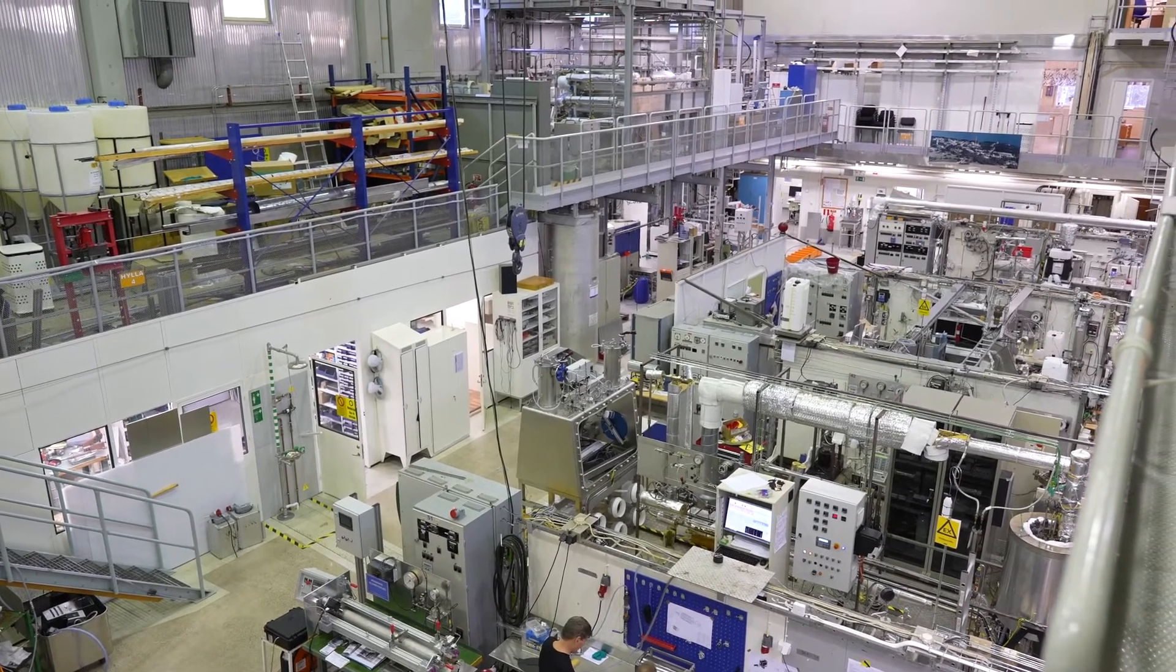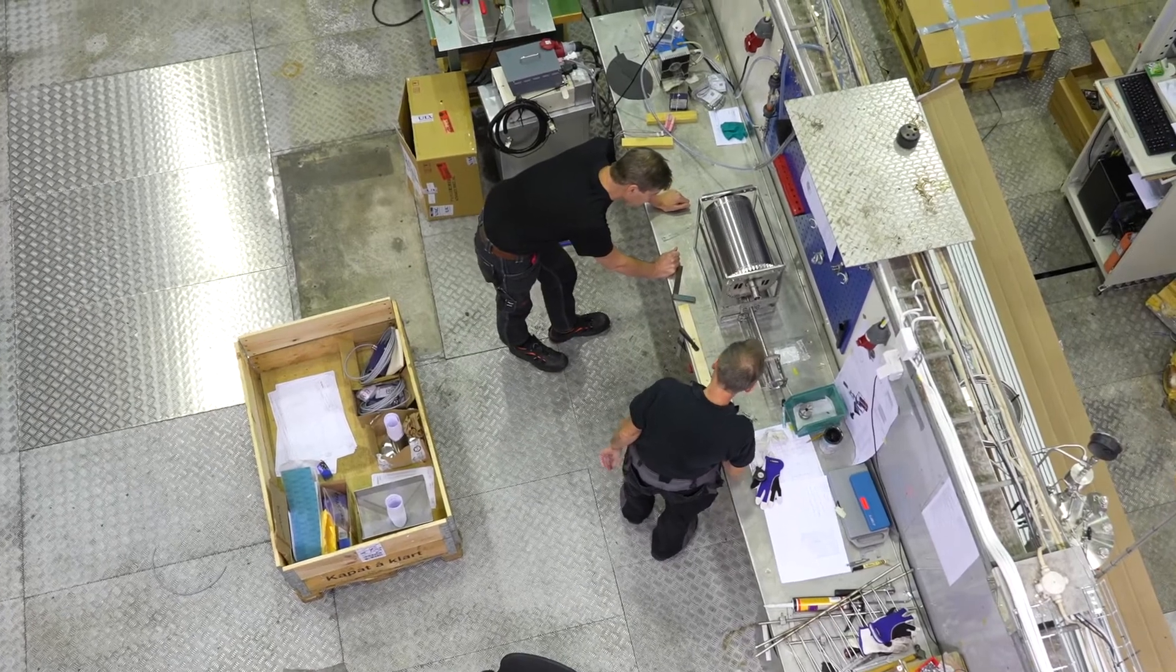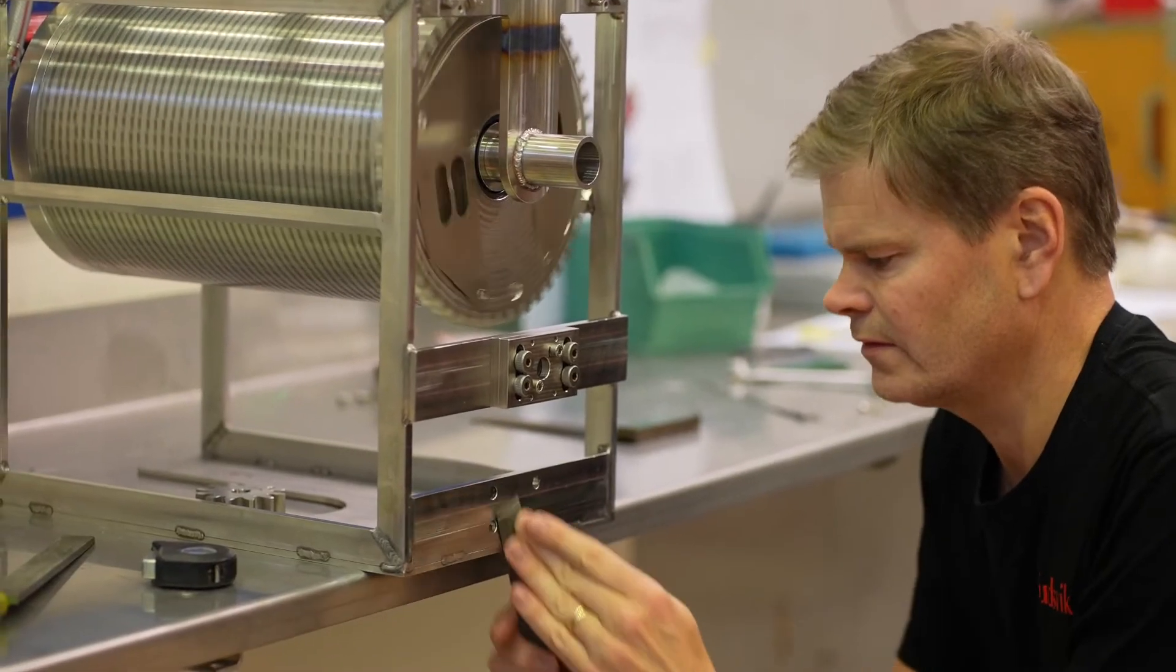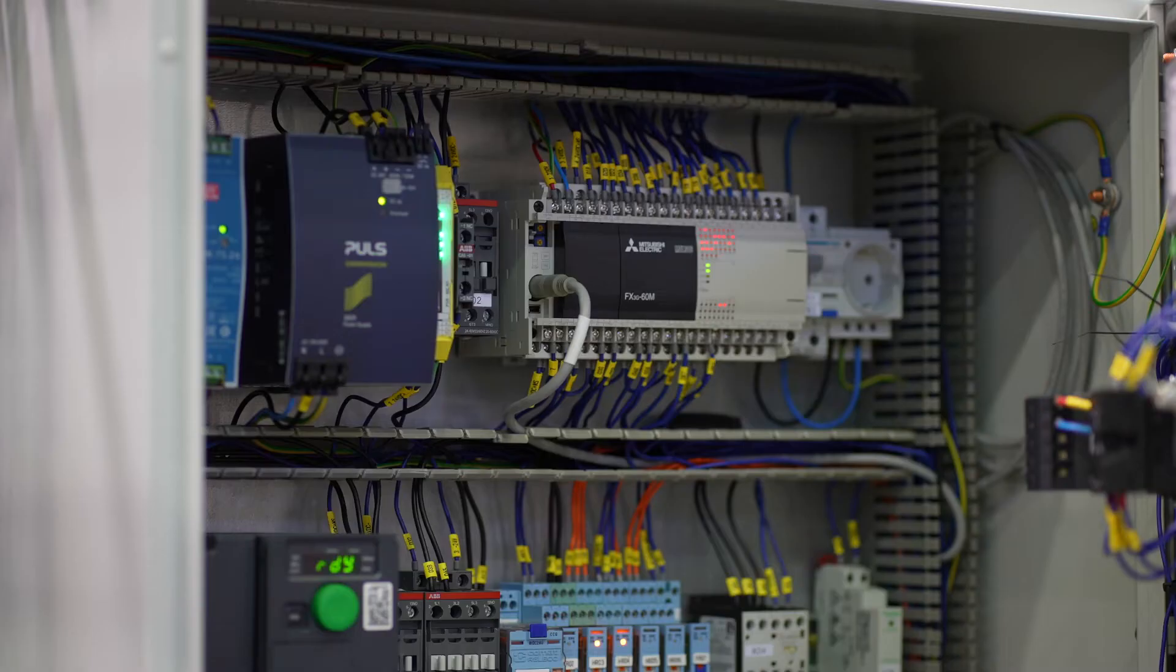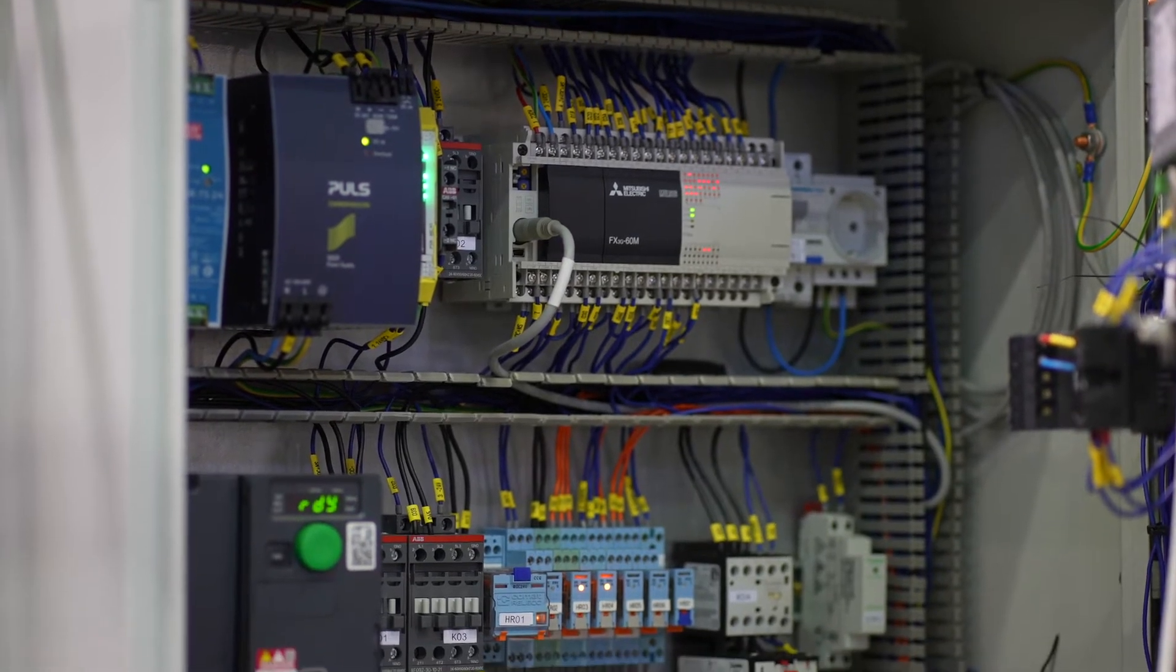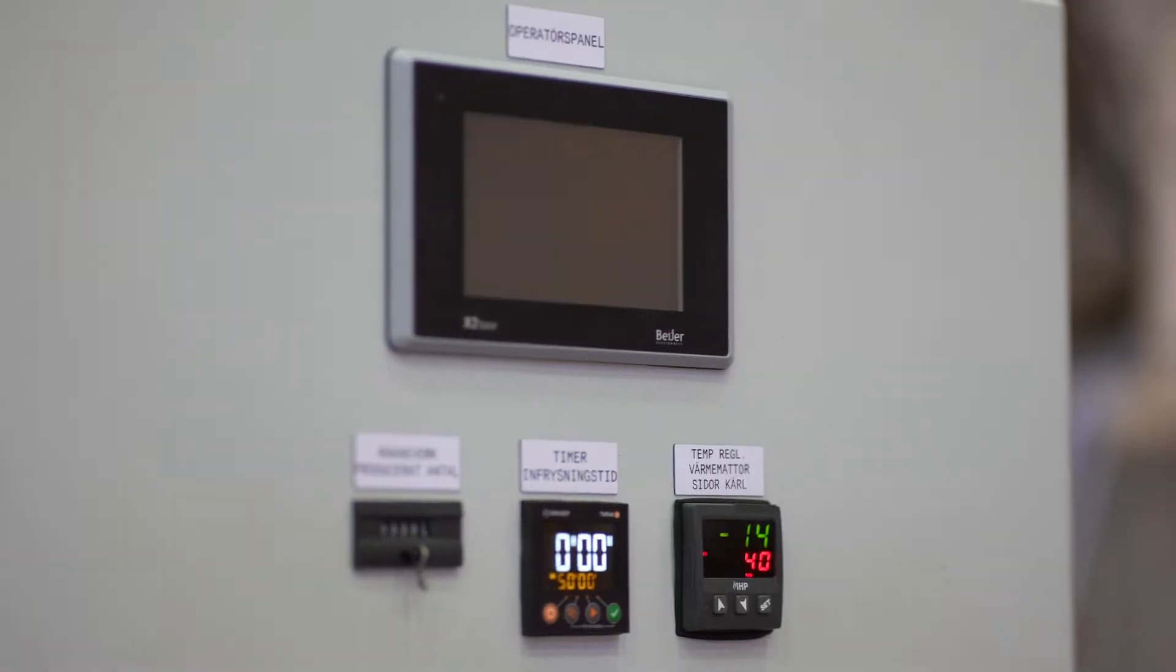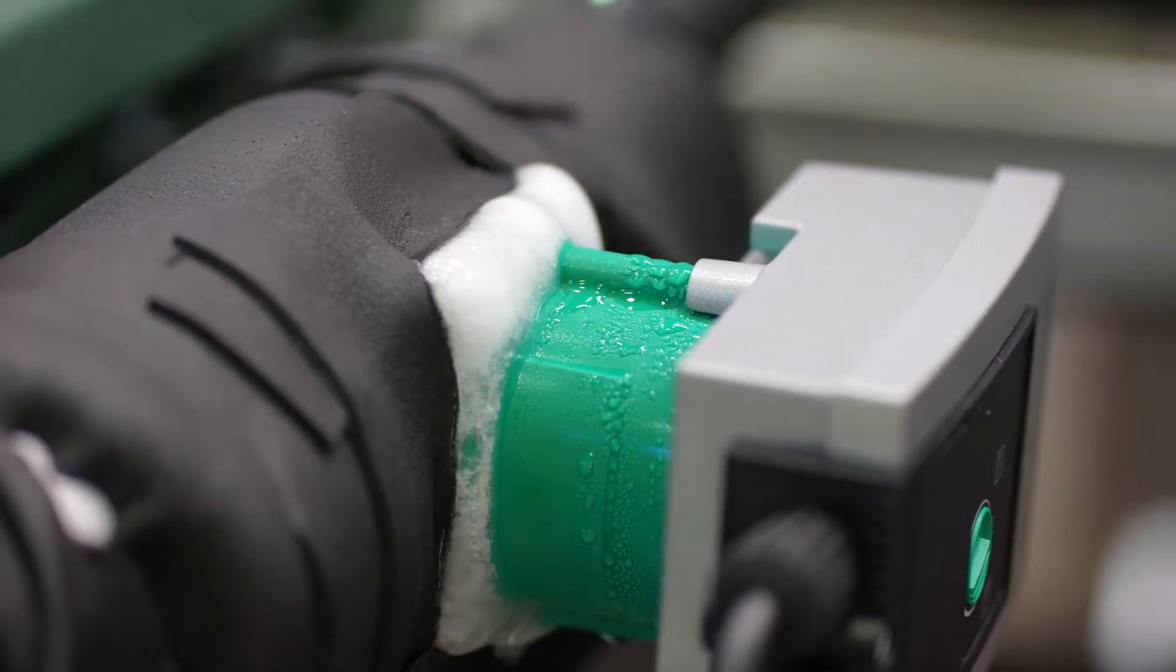The heart of the laboratory is the water purification plant for the production of degassed high-purity water. The system produces 500 liters per hour and supplies all autoclaves in the laboratory with water. The degassed, purified water is produced from tap water using several cleaning steps.